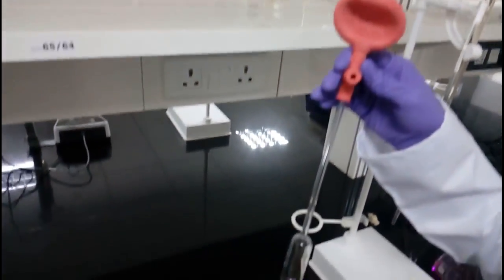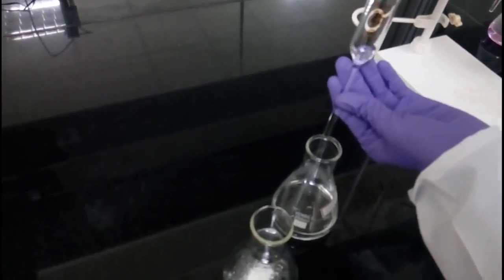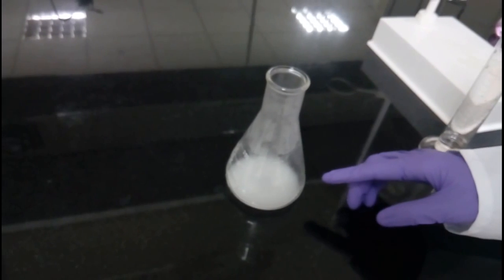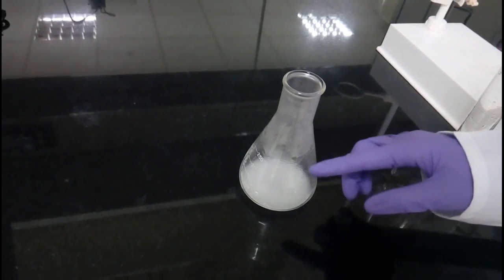Pipet out 25 ml of 0.1 normal HCl using a 25 ml pipet. Shake well until the tablet is totally dissolved in HCl. The bases present in the antacid are neutralized by the hydrochloric acid.